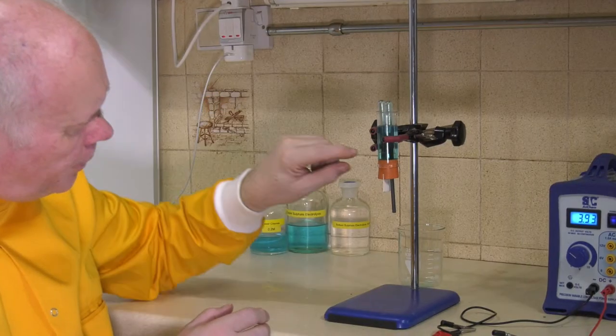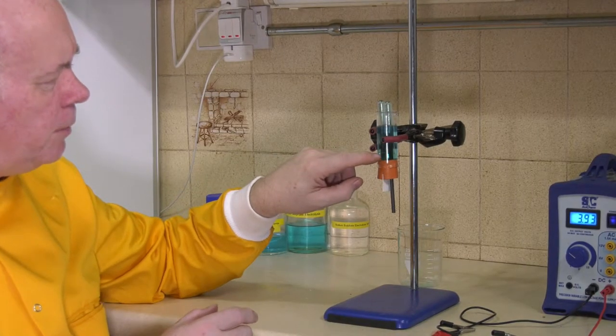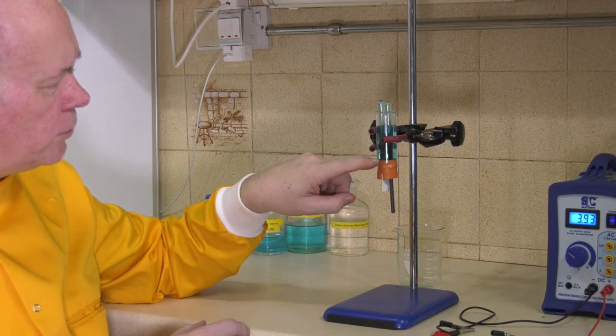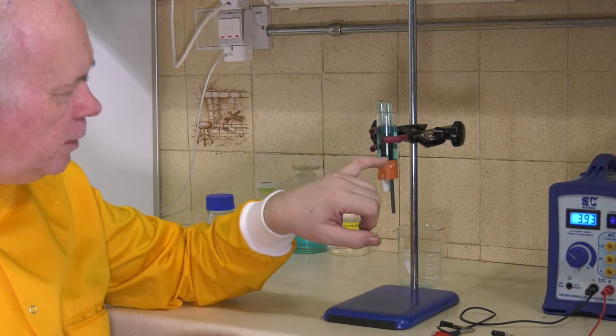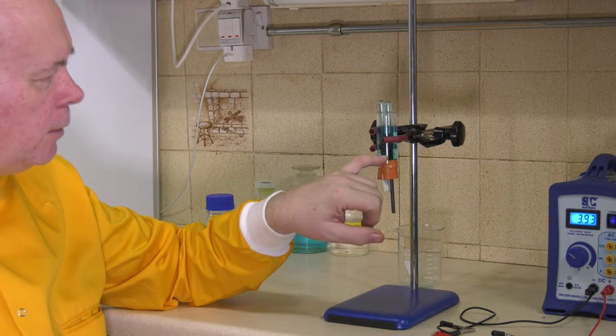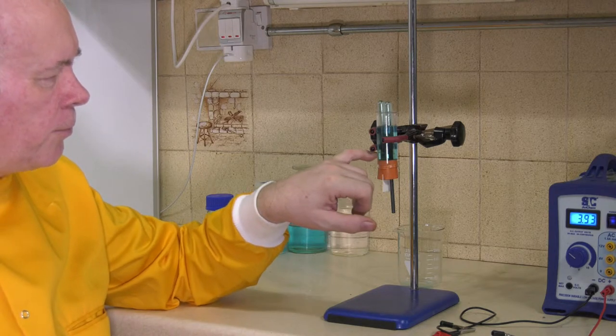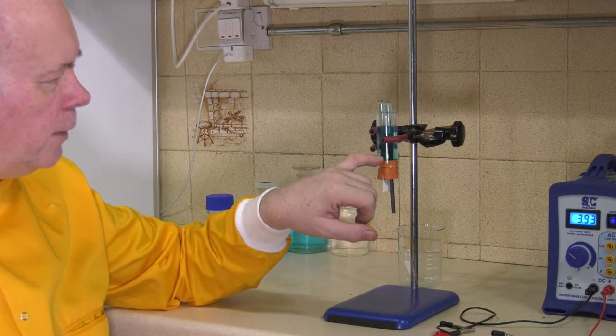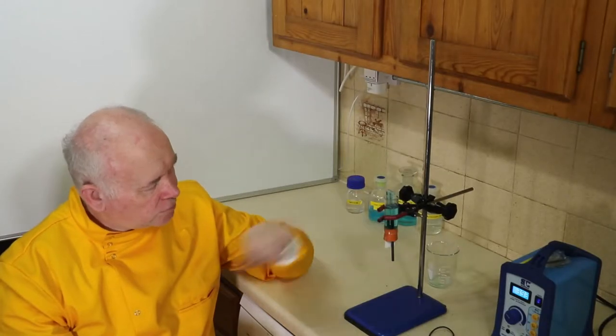But there's about half to one centimeter gap on top, and the advantage of this is that electricity can go through the liquid from one electrode to the other, not being stopped by the glass of the test tubes.